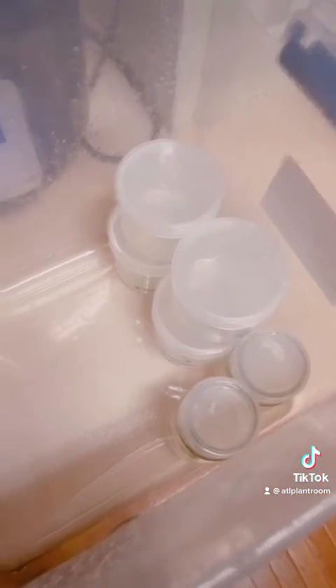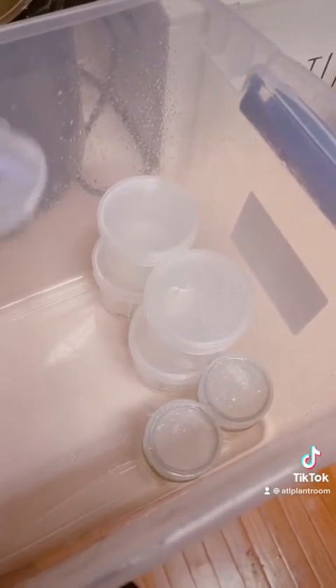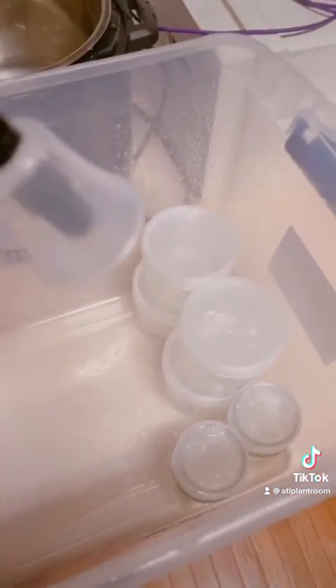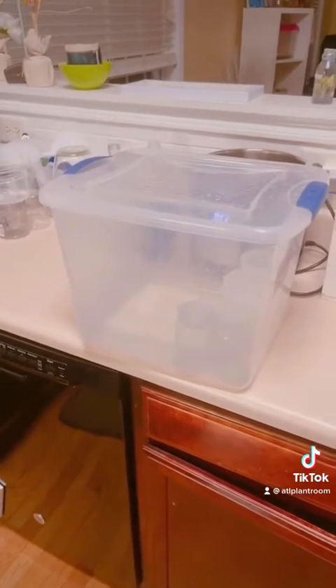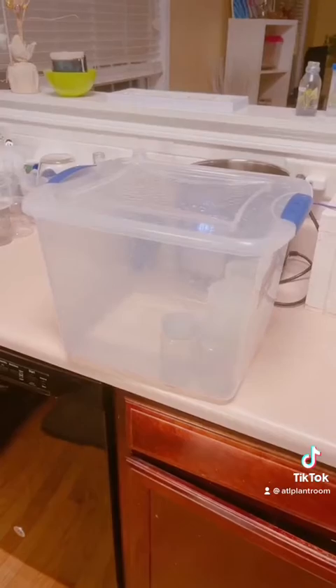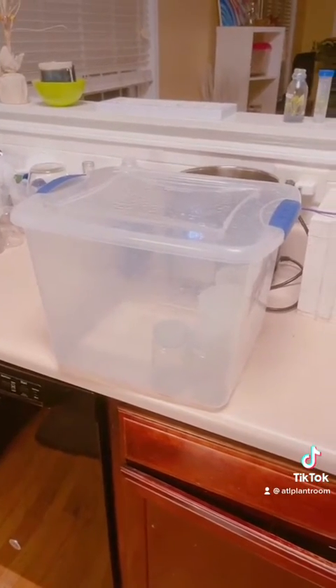Now I've got everything in. I'm going to spray all those down and then close this lid and seal it. That is done. So now we're going to add more flasks to the Instapot, which I'm using as an autoclave.